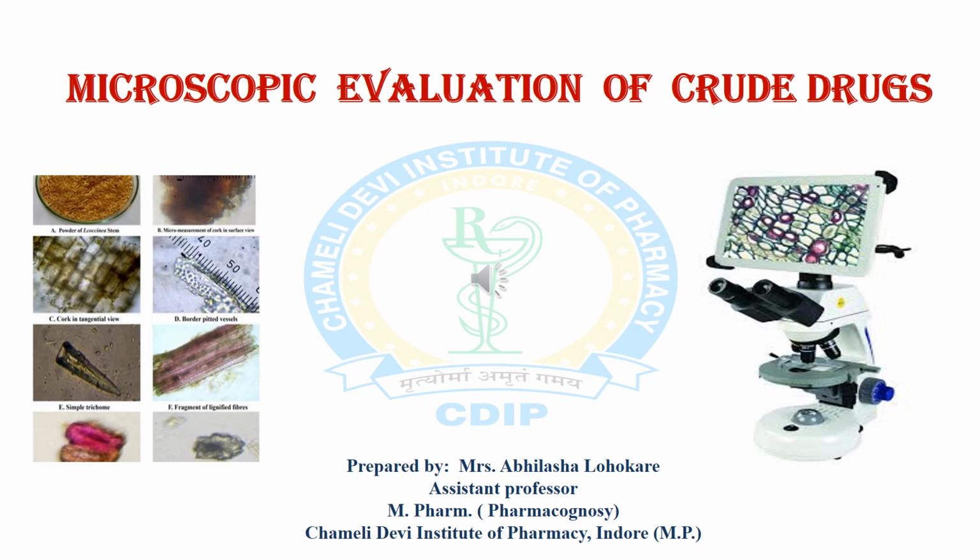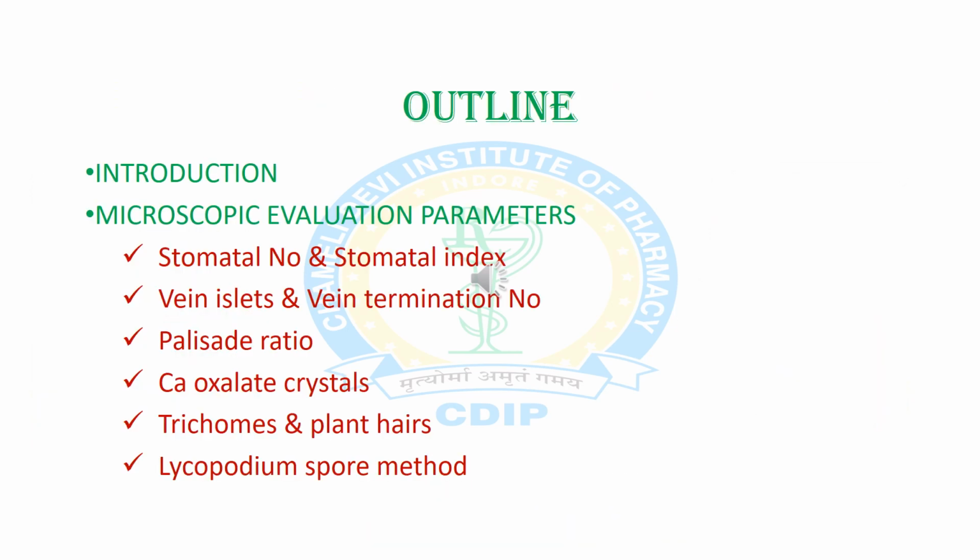In this slide, we will discuss microscopic evaluation of crude drugs. This slide covers the outline for this topic. First point is introduction, second is microscopic evaluation parameters. There are various types of parameters by which we can evaluate drug microscopically.